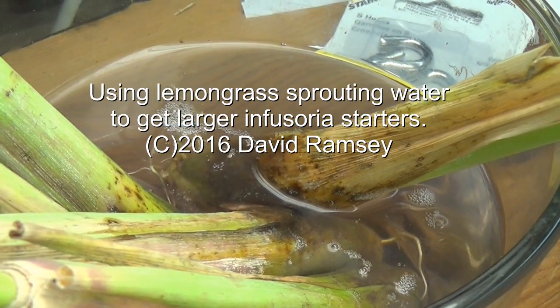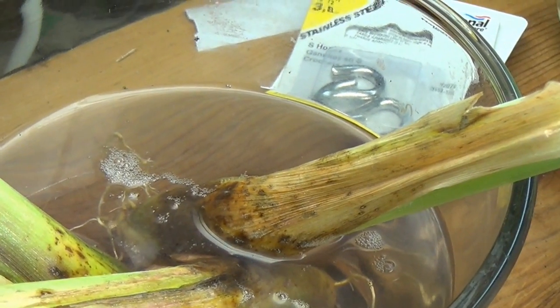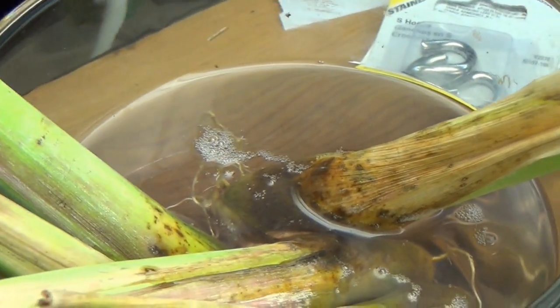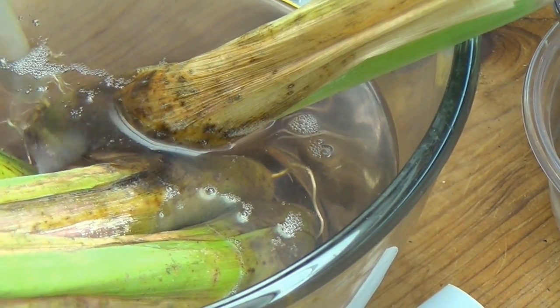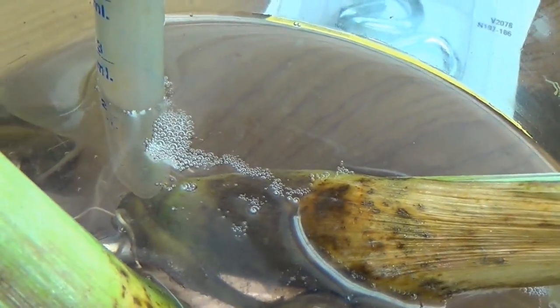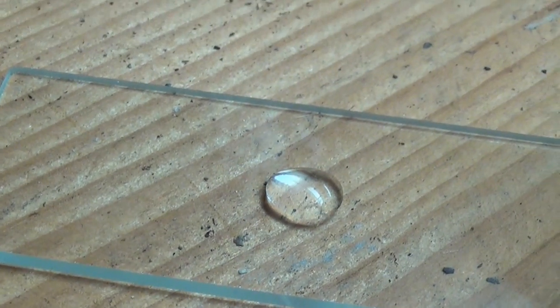Hello everyone. This is the water that my lemongrass is sprouting in, and I have to change it over a couple of days because it starts to get cloudy. It occurs to me that that cloudiness may be something that's useful. So I'm going to take an eyedropper, go down here by the roots, get a drop of water, put that drop on a slide, and see what I get under the microscope.